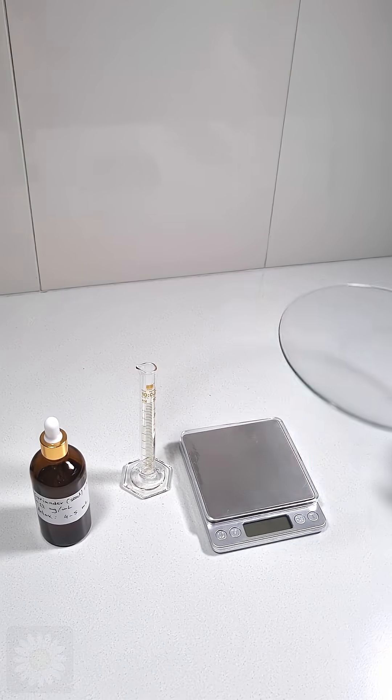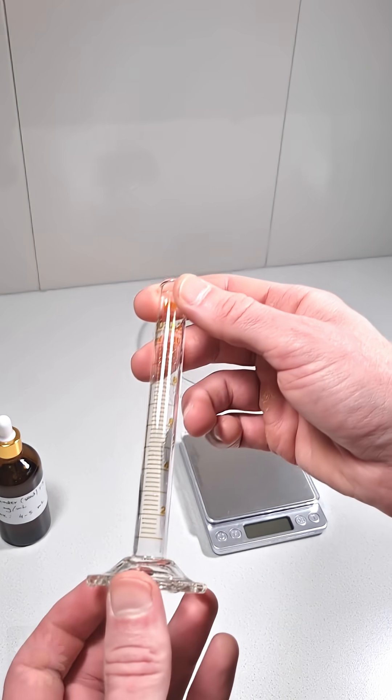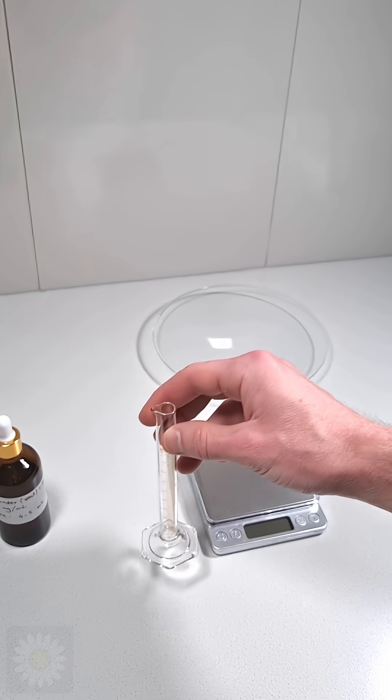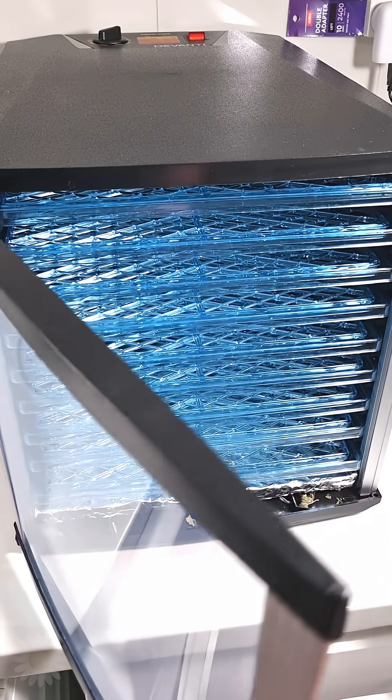You'll need your tincture, a watch glass or plate for fast evaporation, a small measuring cylinder, and a precision balance for at least 50 milligrams. A dehydrator helps, but isn't required.